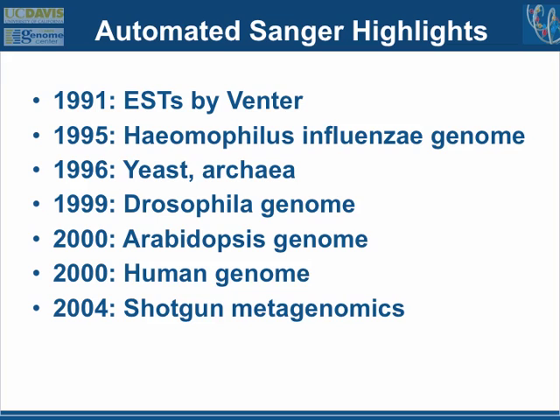And so when I was at TIGR, I went in 1998. My first genome project, I sequenced a bacterial genome. The total cost of the project for a 2 million base pair bacterial genome was about $800,000. And today the cost is about 50. I mean, the sequencing technology with the next generation sequencing methods has really been completely insane in terms of cost.